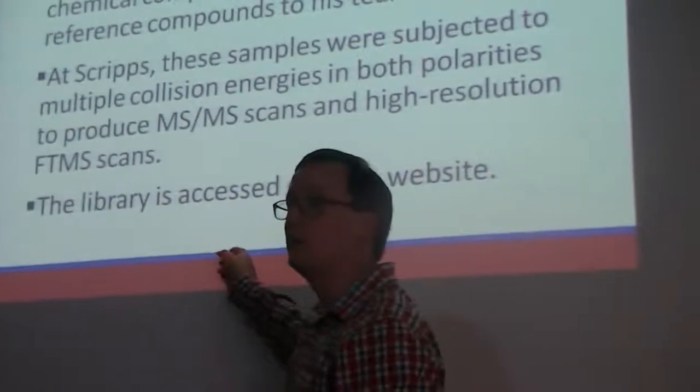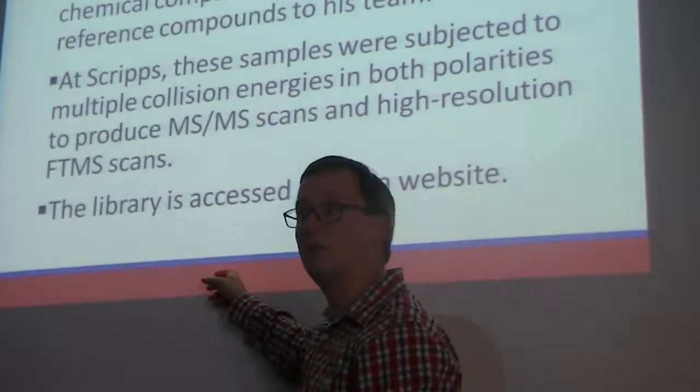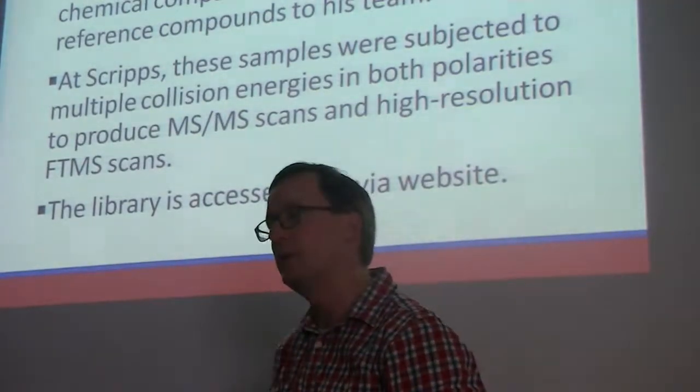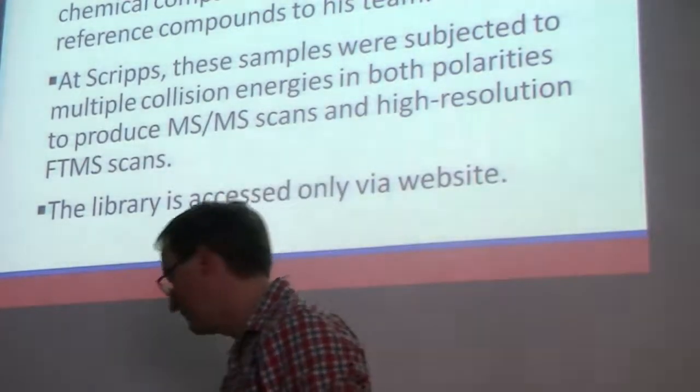You don't have to download their library. In fact, you can't. But if you have a tandem mass spectrum, you can send it in via their website and get a putative identity back.